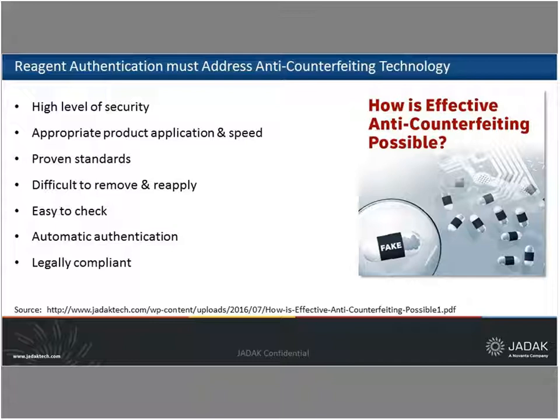So these tags do have information about the component itself, how it's used perhaps, when it was manufactured, when it expires. Somebody's got to write that onto that tag, and you want to make sure that that's easy to do in a manufacturing environment. And then ultimately, after it's produced and used in the clinical device, you want to make sure it's quick and easy to use in that application as well.